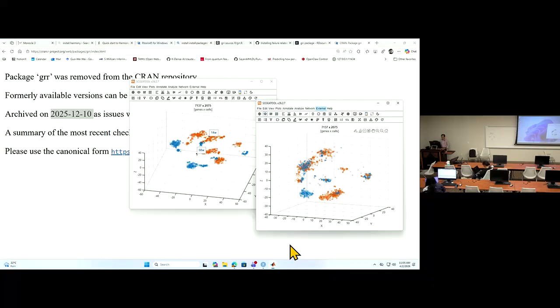extract alpha cells. Because if you have multiple different cell types, how will Monocle run? But if you have a stem cell and something derived from stem cell, you put them together, that makes sense. But here, they all have differentiated into a cell type already.